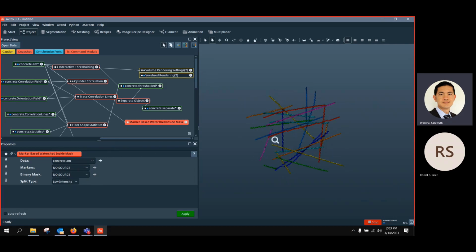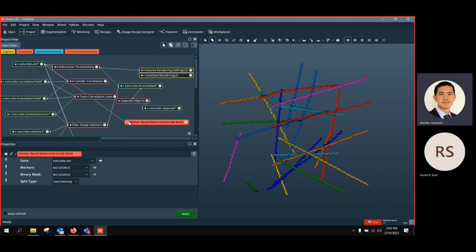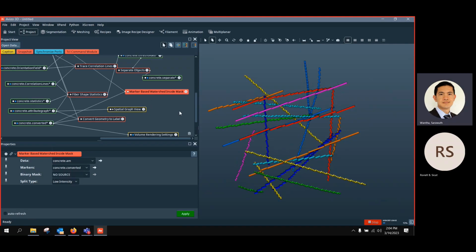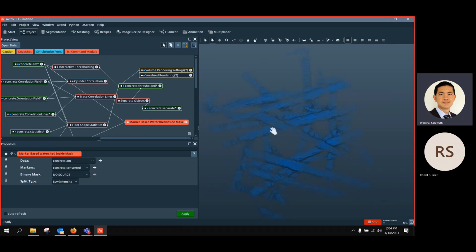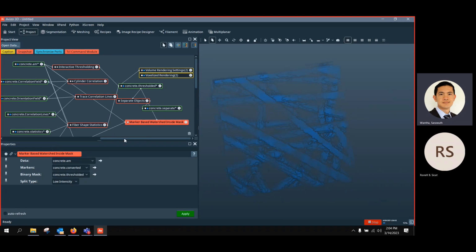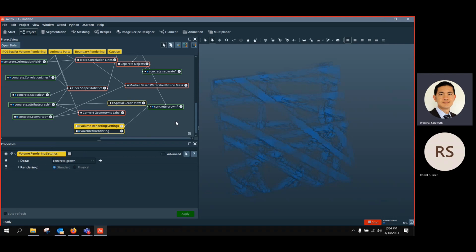The marker is this one, the one we just converted from the spatial graph to a label image and labeled. So I just connect the markers port to this one. And then we need to input the binary image. The binary image is not this one, but this one. So this is the binary image, and I connect the binary mask from the threshold. So we have grayscale, markers, and binary mask, and then click apply. So I get the result of the watershed segmentation that can look like this.